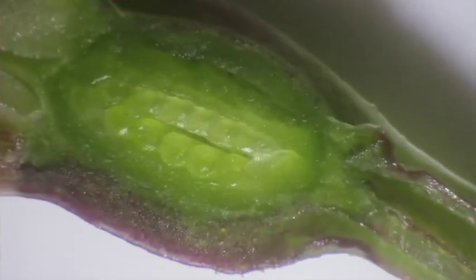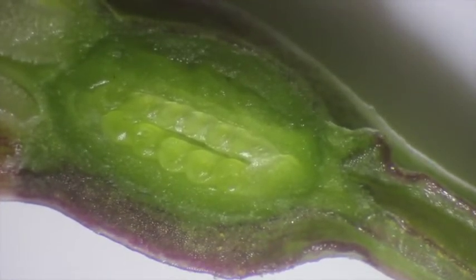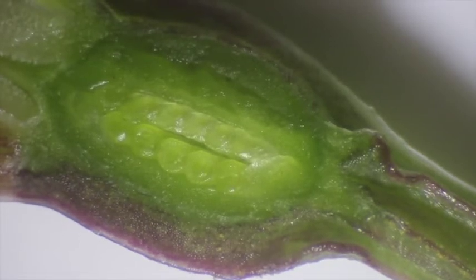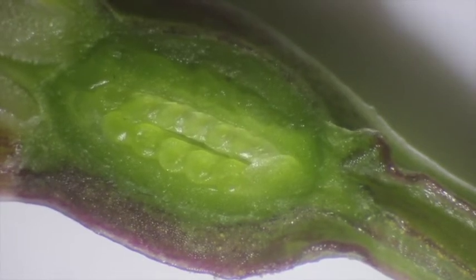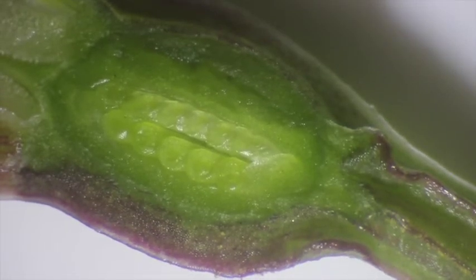Cool. So, and here's that long section, excuse me, through the ovary, that you saw me take with the scalpel there. The outside part is the ovary, right? The ovary is diploid. And flowering plants' key characteristic is that the ovary fully encloses the seeds.